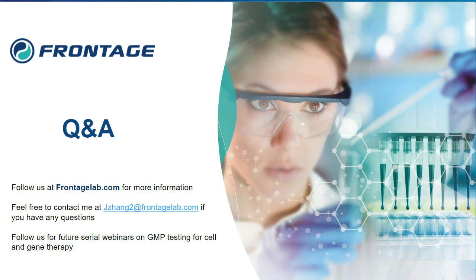So first question, Jessica, besides the analytical methods discussed in the presentation, what are the other critical methods for AAV vector quality control release that you can share? Yeah, as mentioned in the presentation, titer by digital PCR is another critical method for AAV release. Nowadays, it's been well developed so far.